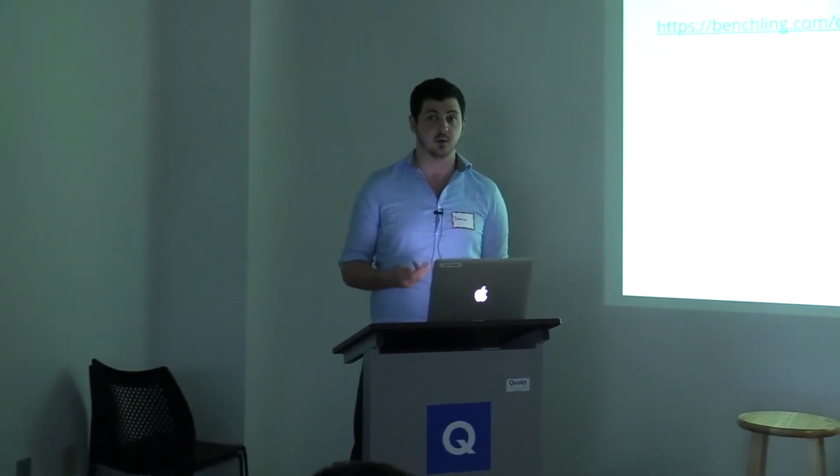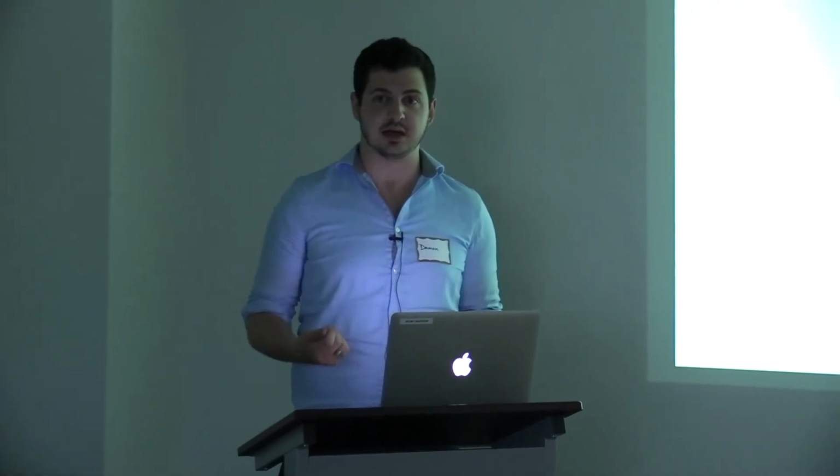Yeah, that's a great question. Basically, what does Benchling offer in the way of publicly available data sets? Benchling as an application does allow you to import genomes, and you can use those genomes and the annotations that come with them in our sequencing tools, our notebook, and things like that. As it stands right now, that's not synced to the warehouse, though.